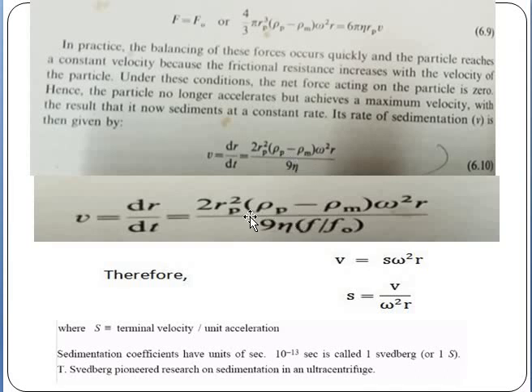From this, v is equal to 2 rp², density of the particle minus density of the medium, into angular velocity, divided by 9η. This is the formula for a sphere, that is, when the separating molecule is a sphere.